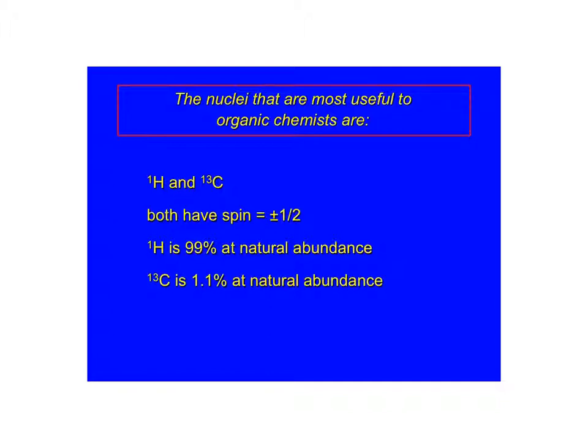It's whenever you get below that threshold that it's going to become more and more difficult. Like if we looked at N15, that's the one for nitrogen, or O17, some of those will be much more difficult because their abundance is much, much lower.